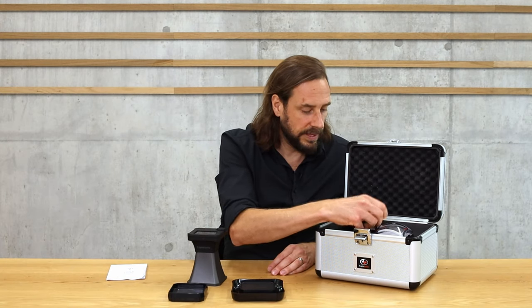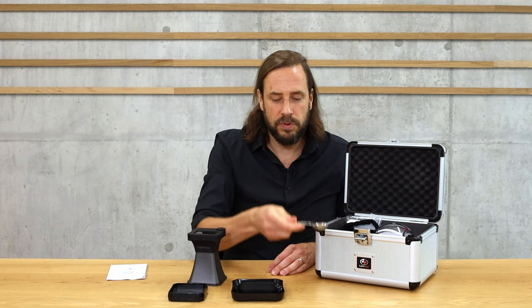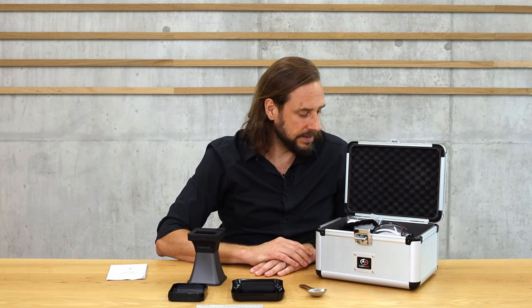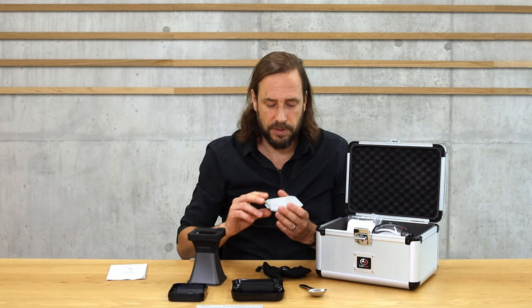You also get a spoon for preparing samples, and this ruler, which is important for distributing the coffee evenly in your sample. I'll show you how sample preparation works in a moment. For color measurement, you also get a calibration plate — calibration is rarely needed, but when you do need it, this little plate is what you use.